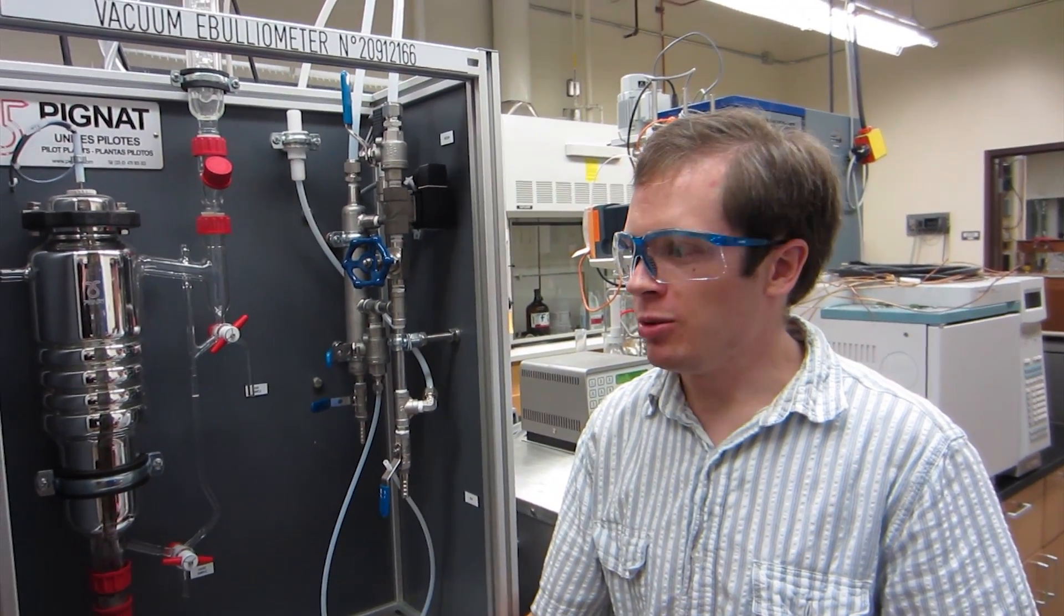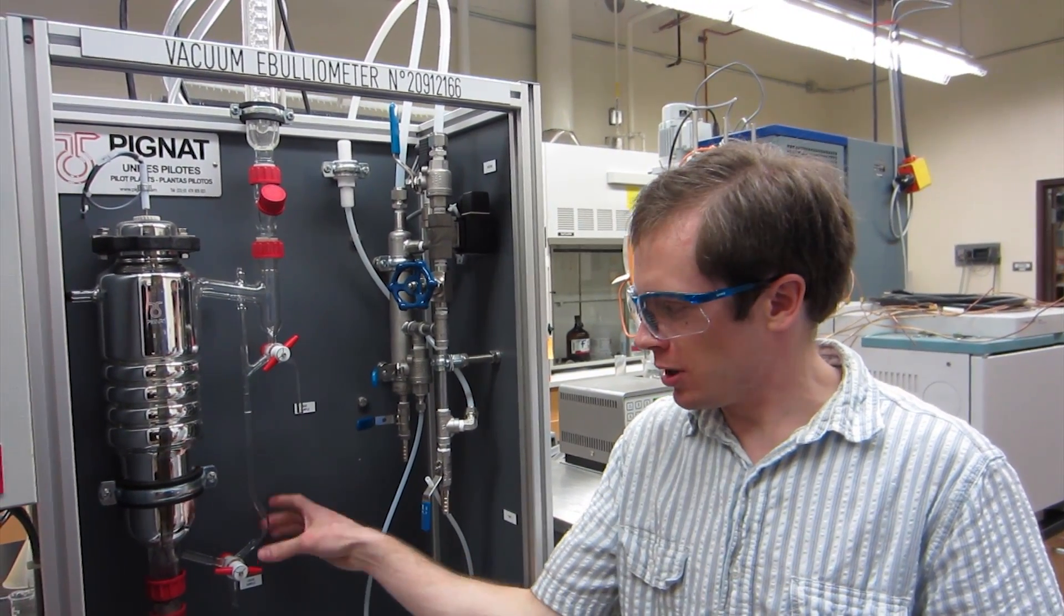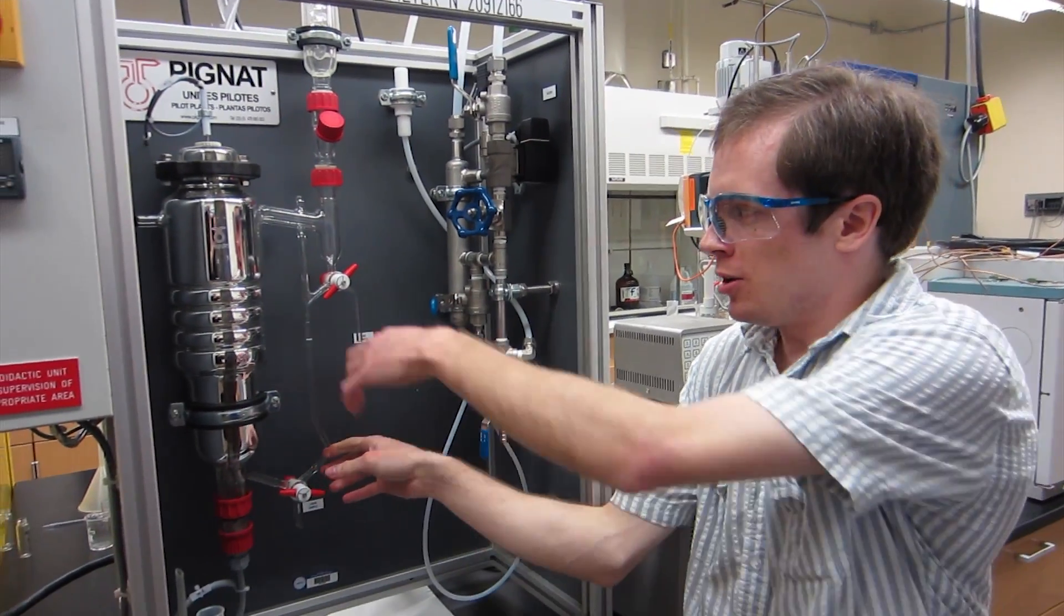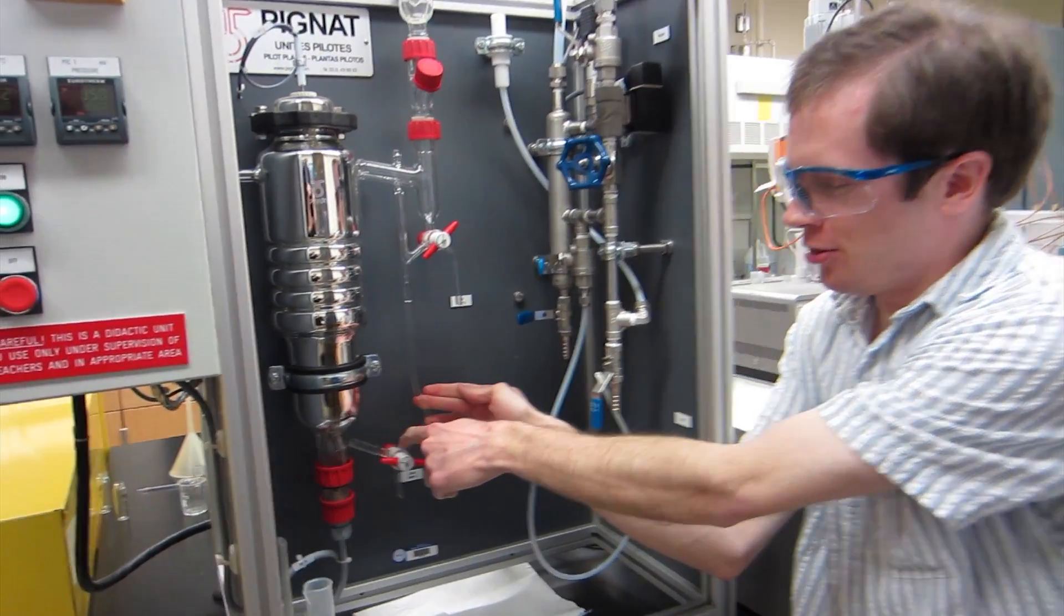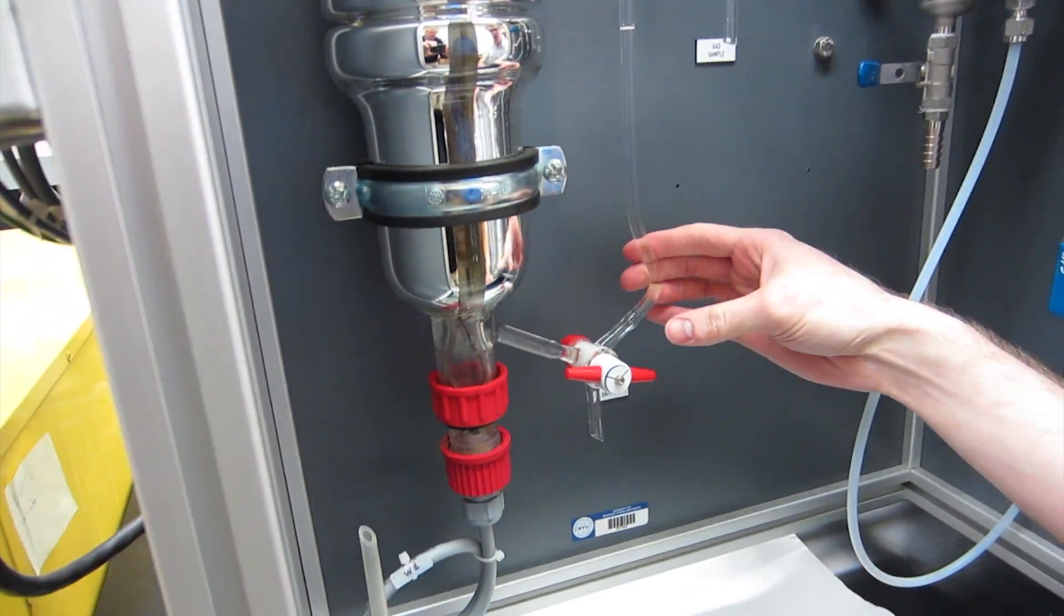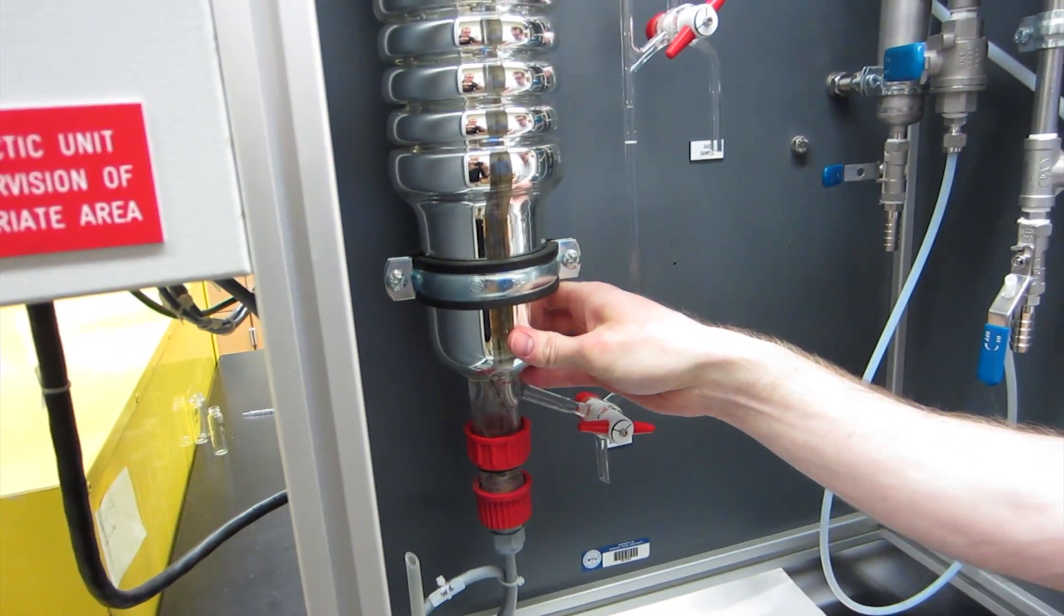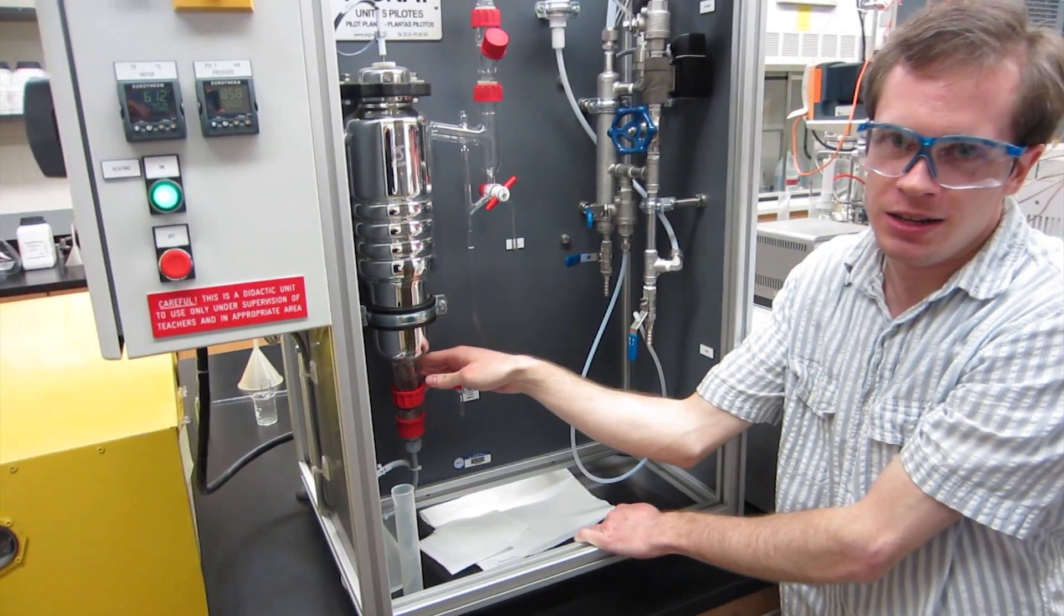So the biggest problem we tend to run into when running this thing is when we're collecting the liquid down here to try to get its composition. You notice that the distillate is coming down through right here and so if you're not careful you can end up getting some of the distillate in there contaminating your liquid.